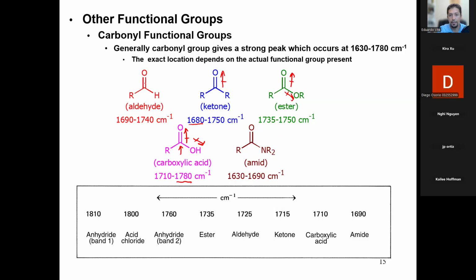And you see an aldehyde, well, that's just one. This one right here is not as strong as this one. So it'll still be strong. You can see it sometimes shows up at 1740, but it starts off at 1690, very weak. And then the amide, well, same thing, right? This N right here distributes the dipoles differently. There is a dipole, but this one is not as strong. And then there's no hydrogens here, so the NC bond is not very polar in general. There's another one this way. So this one has a little bit less. But again, these are general regions. These are general areas. They don't always show up exactly at these numbers.